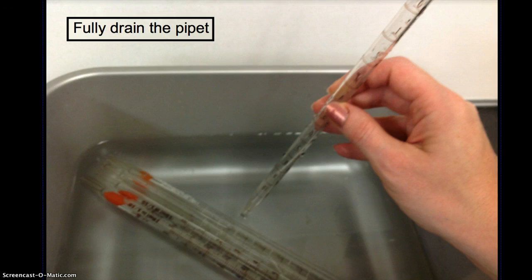When obtaining the pipette, fully drain it from the bin that it is stored in, because currently they are filled with water, and it would be very messy and not safe to walk through the lab with dripping pipettes full of water onto the floor.